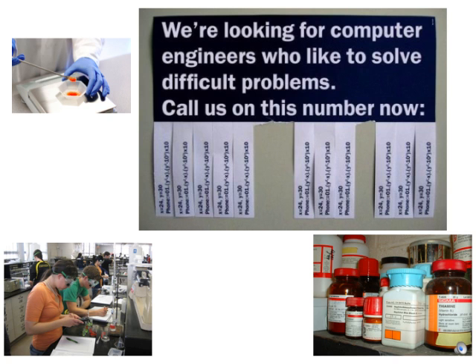This presentation gives you a flavor of the DNA Lab workshop. The DNA Lab workshop equips you with skills involved in making strategies in molecular biology. The workshop starts with calculation exercises.